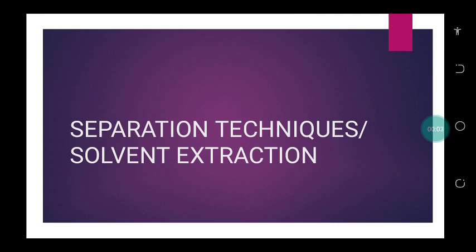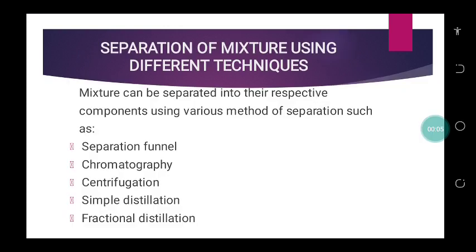Separation techniques and solvent extraction. The importance of most mixtures is for them to be separated into their respective components, and there are various methods used in separating components of mixtures into their various and useful components. One of them is the use of a separating funnel.